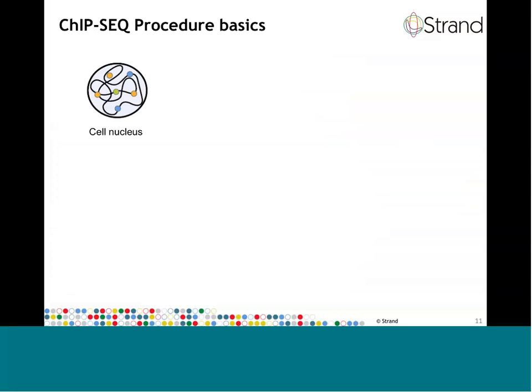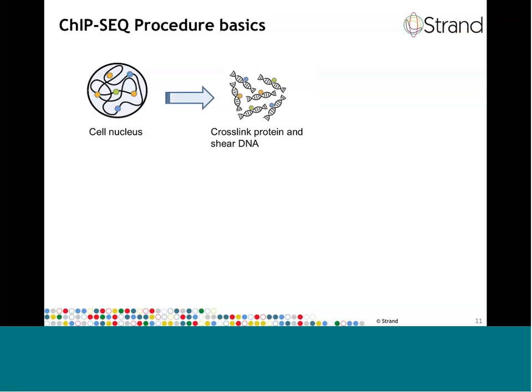So this slide explains the ChIP-SEQ experimental procedure that precedes the data analysis in Avadis NGS. So you normally start with a cell that is in a particular state, either growth phase or disorder, for instance, and the cell is then treated with a chemical that results in the cross-linking of all DNA binding proteins, such as transcription factors and histones, etc.